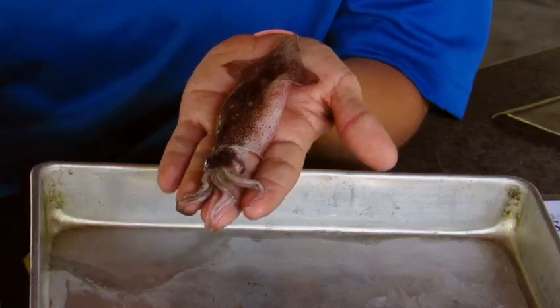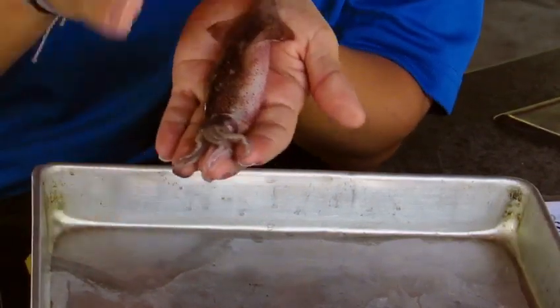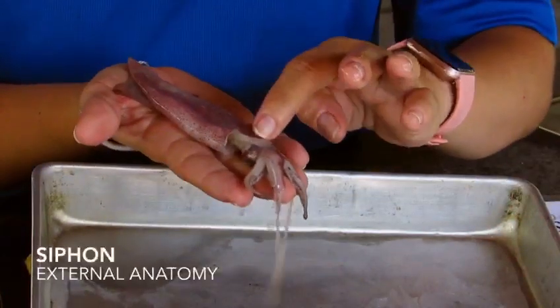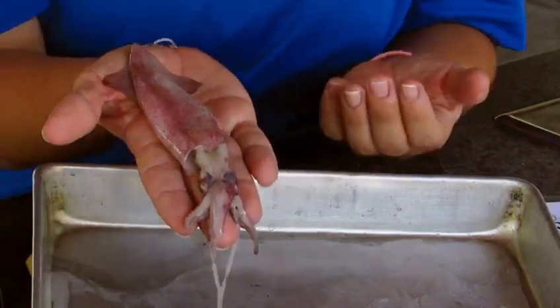They actually swim with something called jet propulsion. They'll inflate their mantle, close off the bottom, and then shoot the water out from their siphon. All the water accumulates and then it gets pushed out, kind of like a boat propeller.